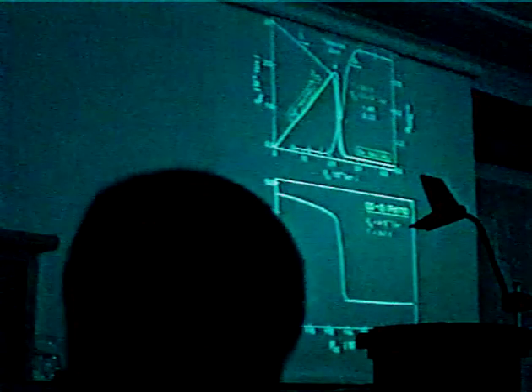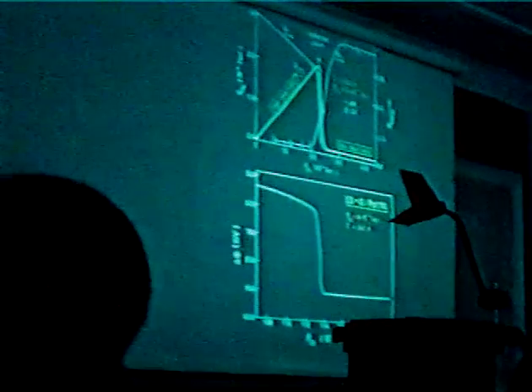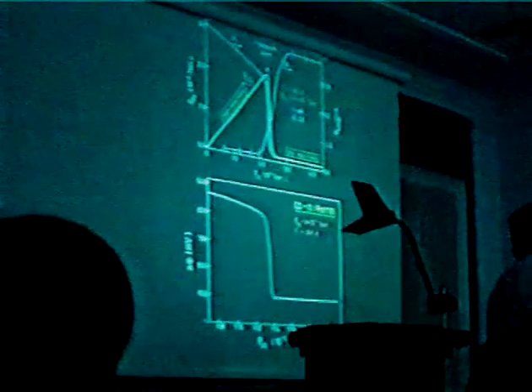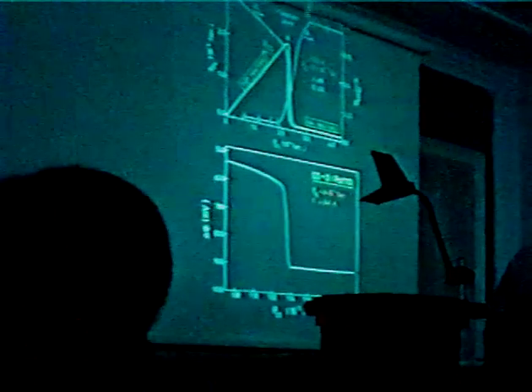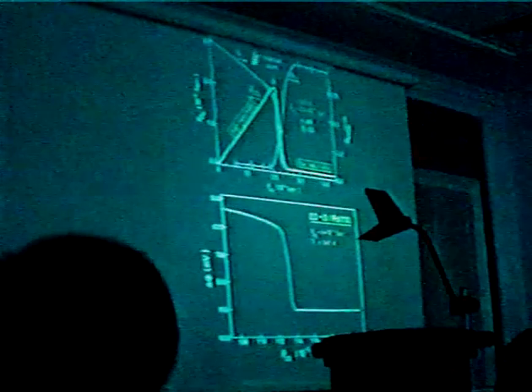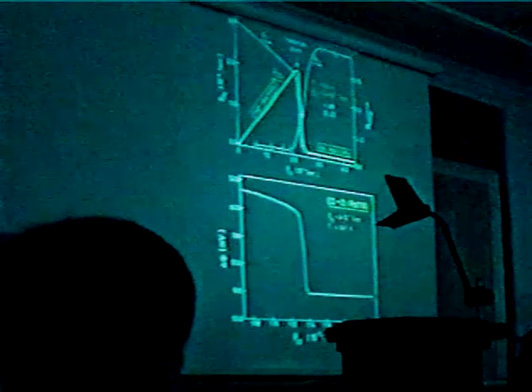And now the surface of such a platinum emitter can be imaged by the work function. The carbon monoxide covered surface has a rather bright appearance because of relatively lower work function and higher emission current, and the oxygen surface has less emission, higher work function, and this can be seen in the field electron emission images.